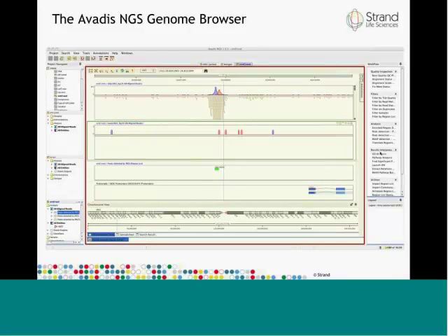The centerpiece is where the genome browser is shown. Other visualizations also share this central area along with the genome browser, but for now we have only opened the genome browser for visualization. The topmost track shows the raw sequencing data, in this case the forward and reverse coverages for the ChIP-seq sample. It also shows the reads in that location.